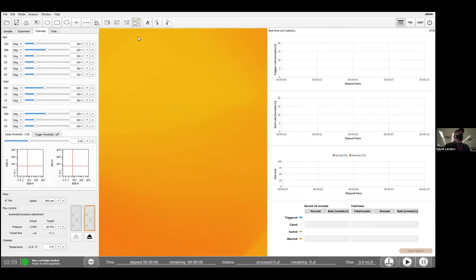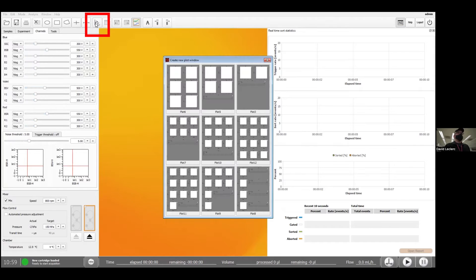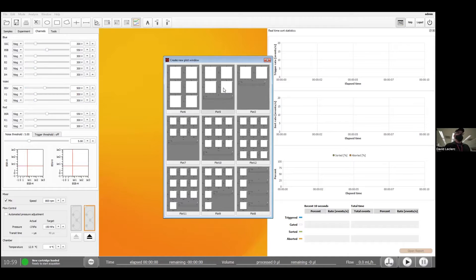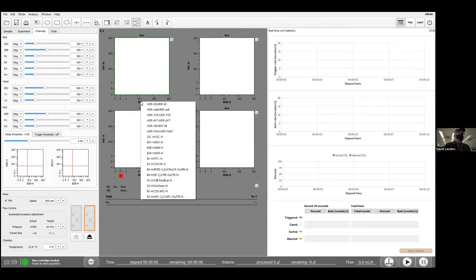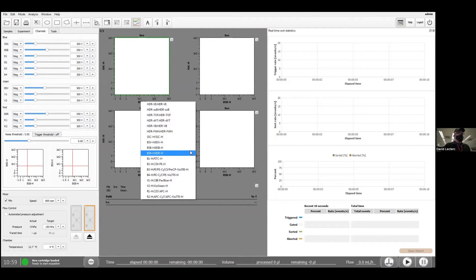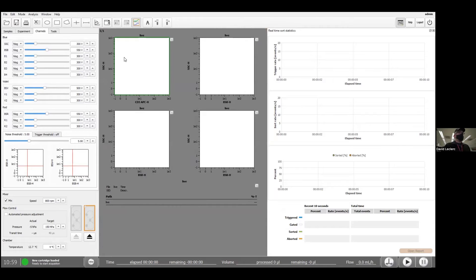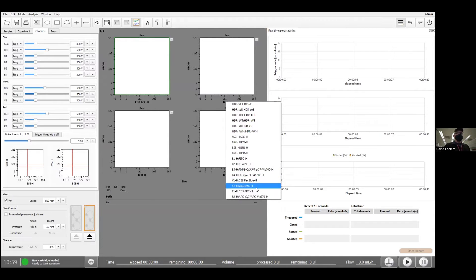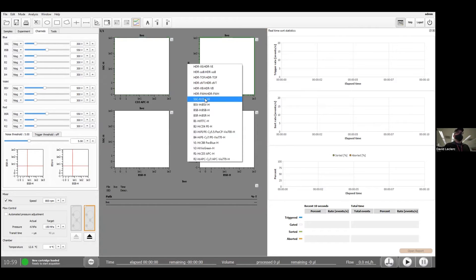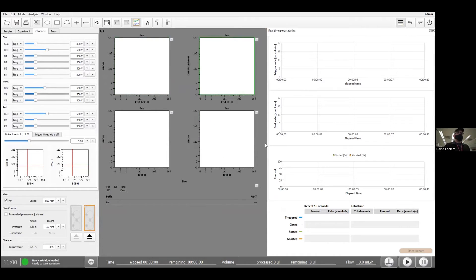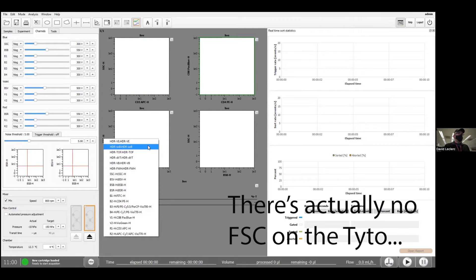Now I'm going to make my graphs to look at the data, so I can click on this guy over here. I think I need four graphs, should be plenty. Choosing the axis, I'm going to start with my CD3 against side scatter. And then CD3, CD8, CD4, CD8.